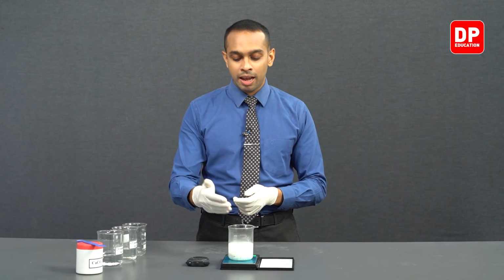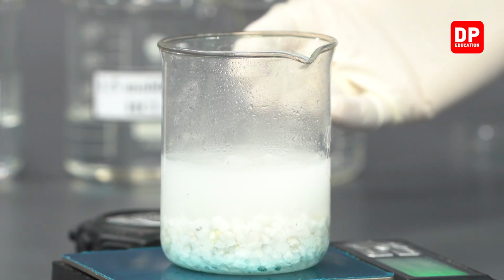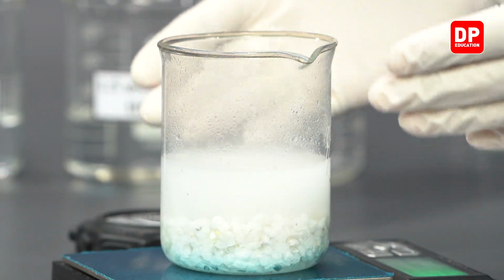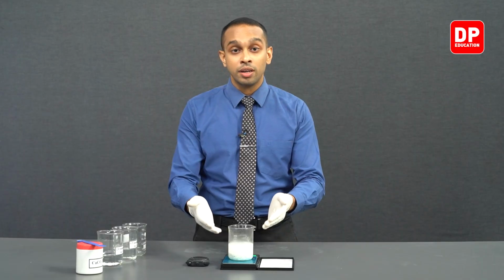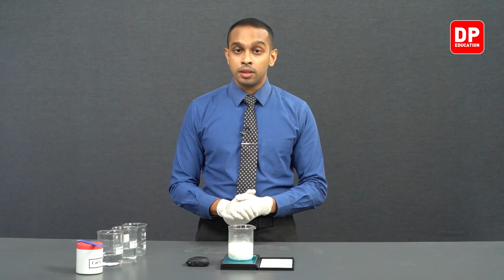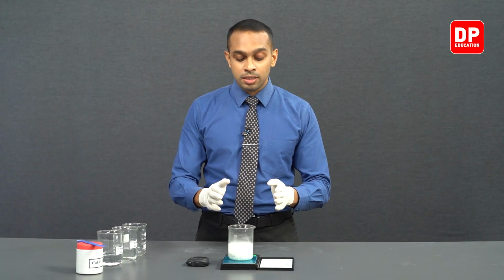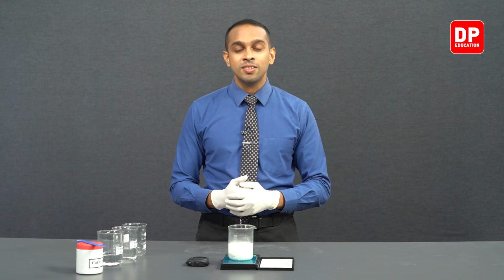You can see as the reaction proceeded, carbon dioxide is produced, and even when we use very large amounts, 100 grams of calcium carbonate and 100 milliliters of 1 mole per decimeter cube concentrated HCl, still the mass differences you see are very small.